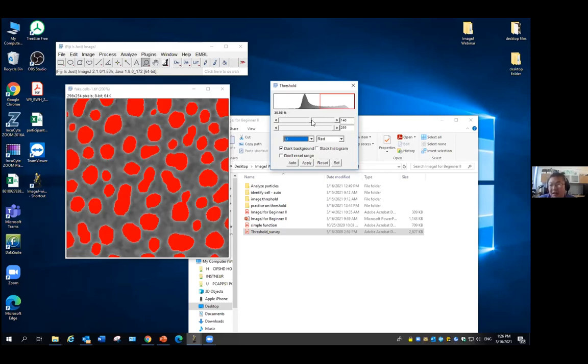So you can choose. The best way is if all your images can be fixed on one thresholding, that will be the best. But in my experience, in the majority of real-life cases, this doesn't work. The images change. You have the control image, you have the experimental type, you add more things into that. You cannot really control all the backgrounds to be at the same level. So in this case, if you use those algorithms, they can actually compensate quite well. So you can try which one works the best.